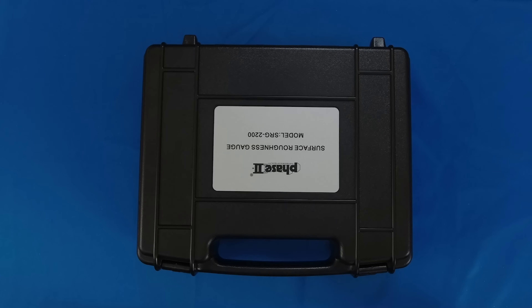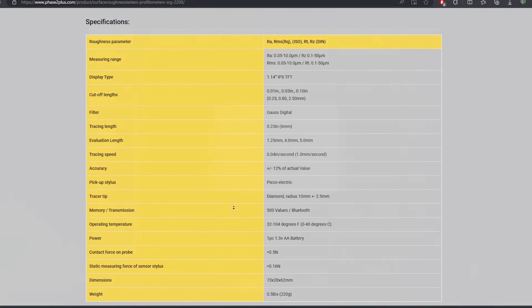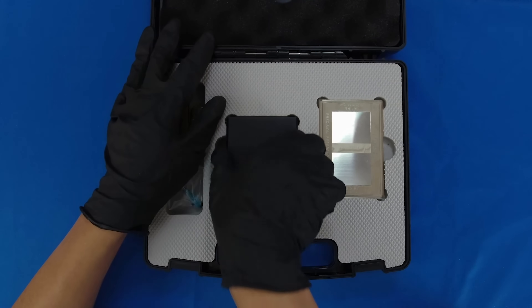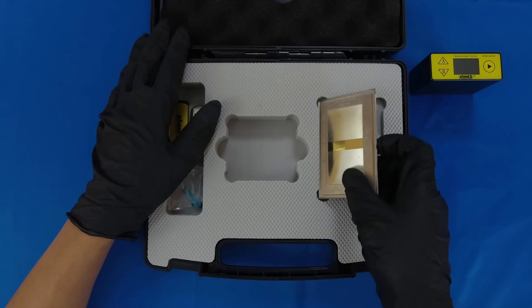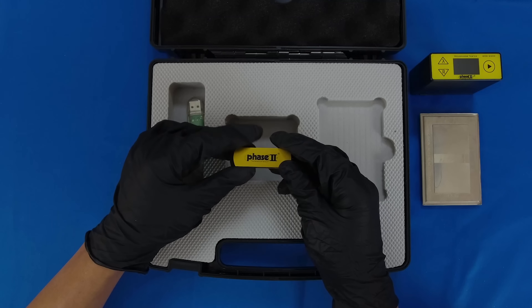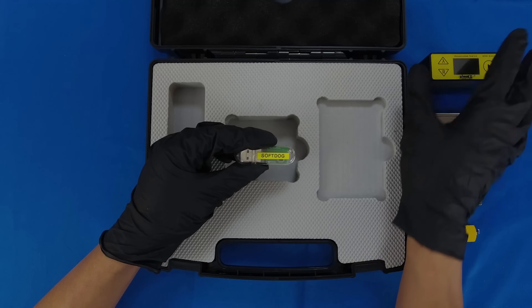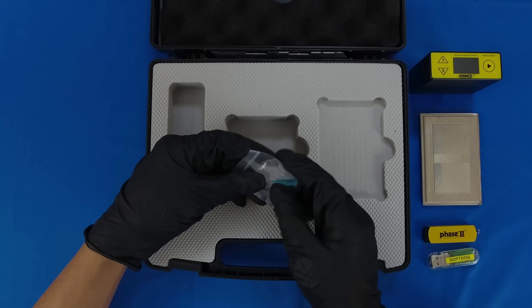There are certain criteria that need to be met in order to operate the SRG2200. You may look into the detailed specifications published in either our catalog, website, or operation manual for more specific information. Inside the kit for the SRG2200, you will receive the SRG2200 itself, along with a AA battery, a standard, two USB dongles — one containing the data output software that is installed on the computer, the other being a soft dongle which connects the unit to the computer — as well as a screwdriver along with some extra screws for servicing.